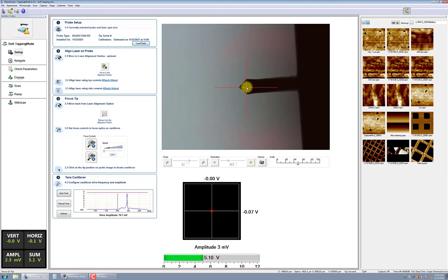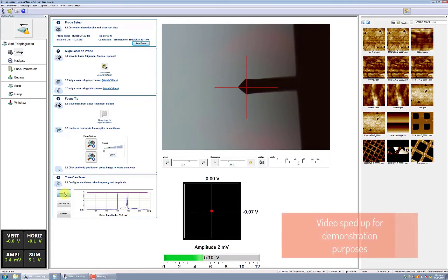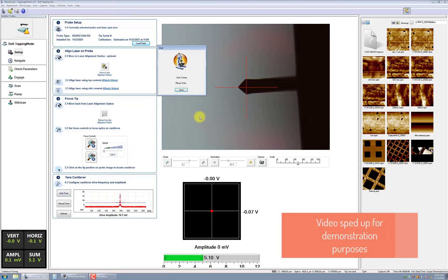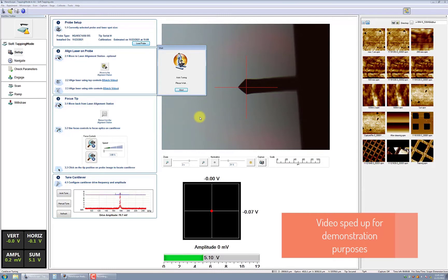Now, press Auto-Tune. Verify that the frequency is correct for the probe you installed. The drive amplitude is normally less than 1,000 millivolts.